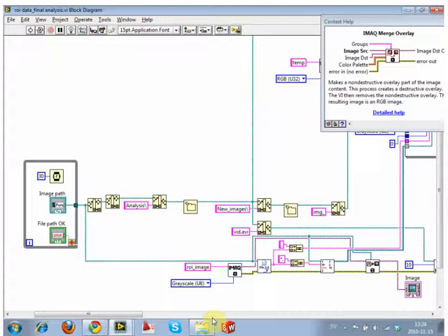Okay, because this is one of the things that always goes wrong, and it will go wrong for you too. Everybody does it wrong. It's kind of like that whole Matrix scene thing. It doesn't matter how good you are. The first few times, if you jump in from one section to another, you're going to make a mess. Files are going to be all over the place. You're going to put files in root directories.